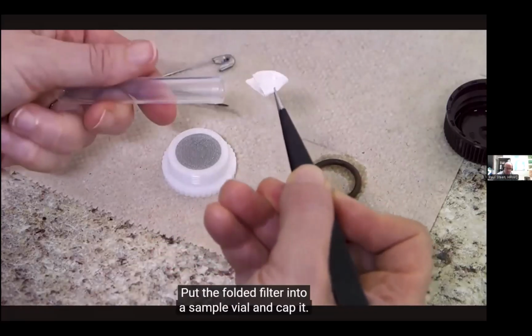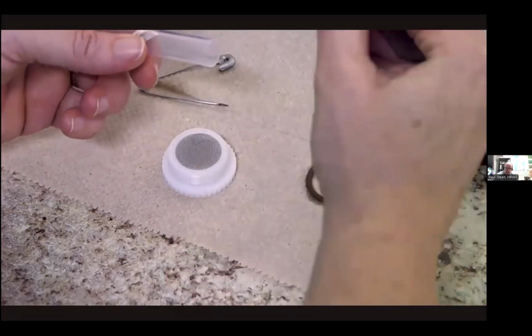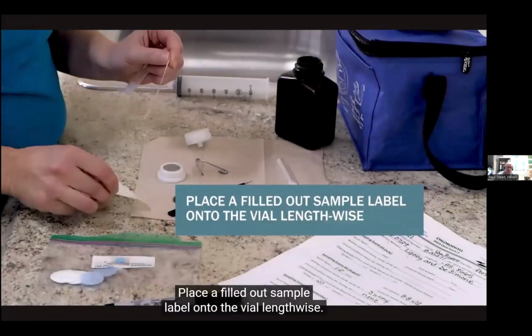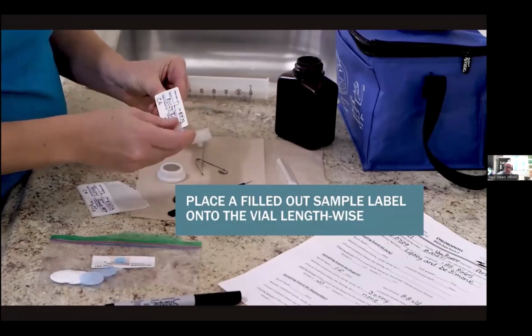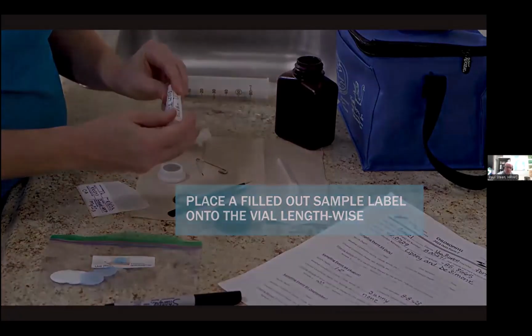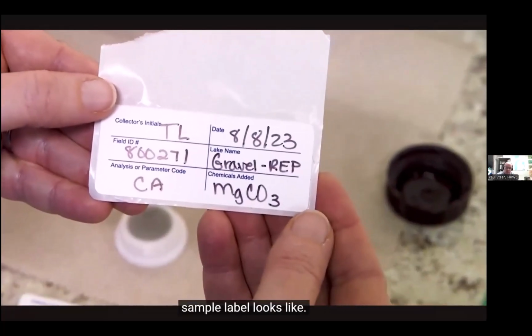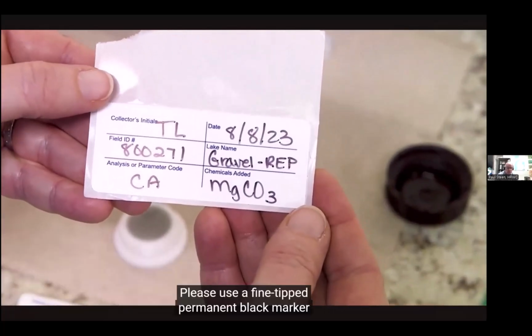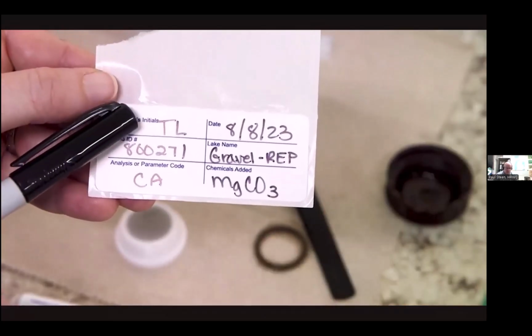Put the folded filter into a sample vial and cap it. Place a filled out sample label onto the vial lengthwise. Let's take a look at what a correctly filled out sample label looks like. Please use a fine-tipped permanent black marker to fill out the sample labels.